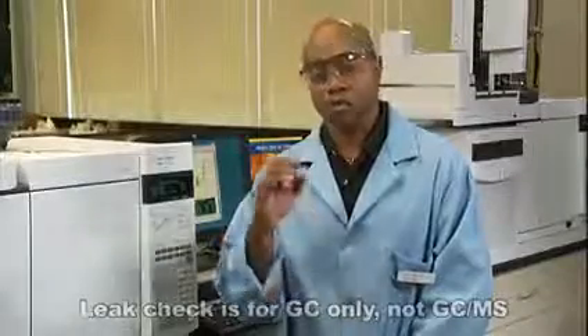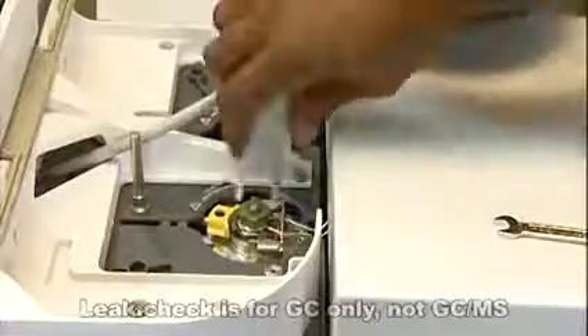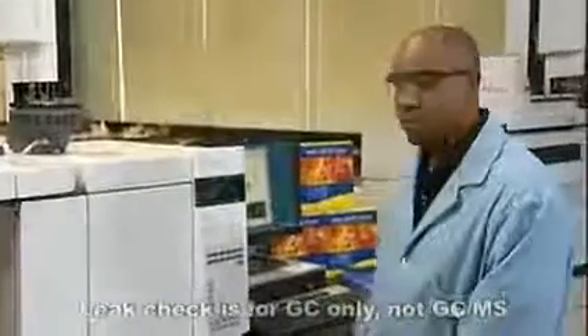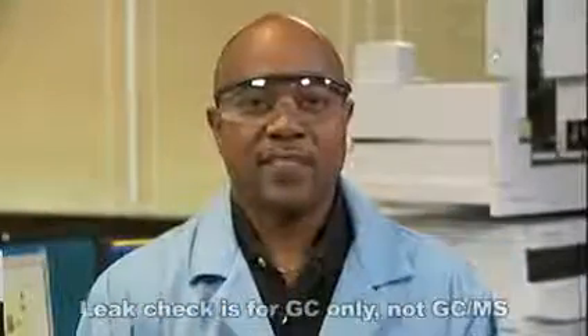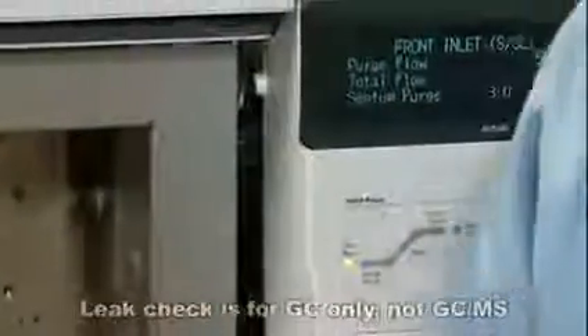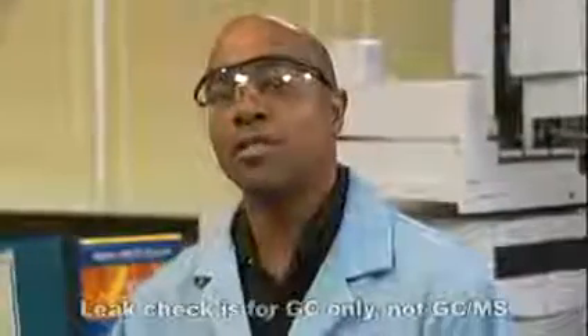I'm going to start from the top of the inlet and work down. First, the septum nut. Next, the closure to the liner — that yellow little lever. That's not it. Now I'll try the column nut. Okay, there we are. You see how the total flow has dropped to less than 10 mils a minute? This is probably good enough for our example.